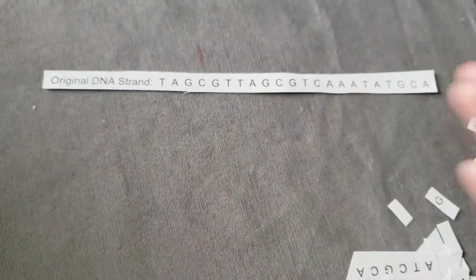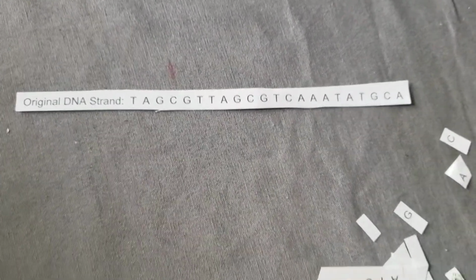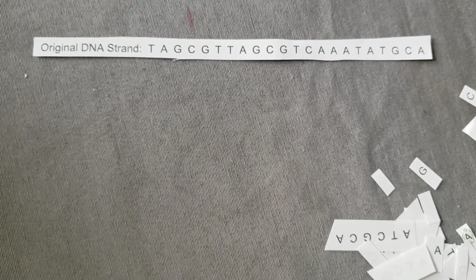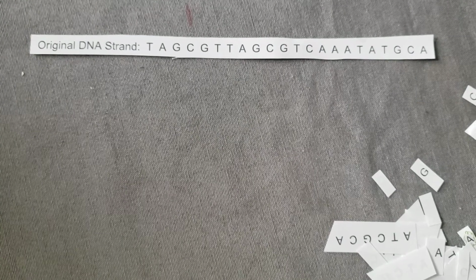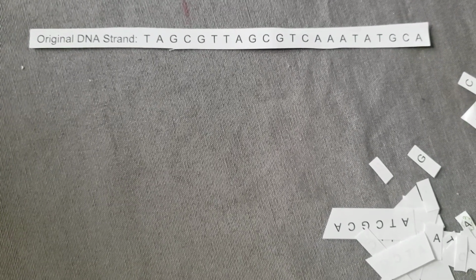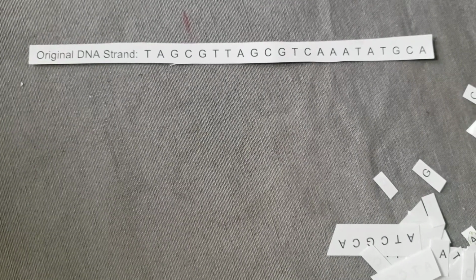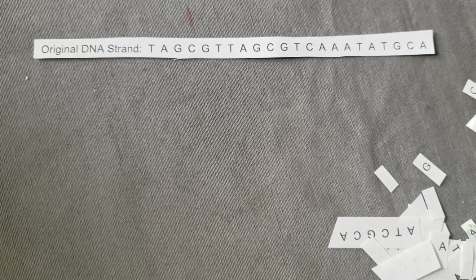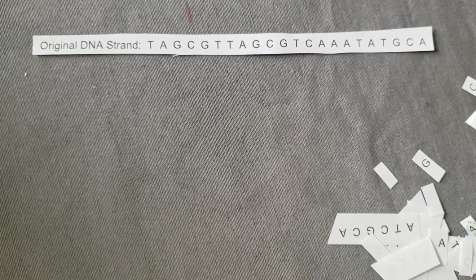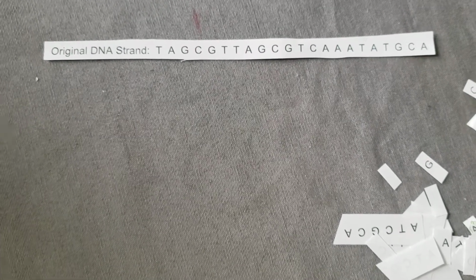We have a pathogen's DNA that we want to sequence. We already know that the individual afflicted with the pathogen is a Homo sapien, a human. So we really don't care about the DNA that belongs to the human. So essentially what's going to happen is we get a DNA sample from this individual, and anything that pops up as human DNA is irrelevant, but anything that's considered foreign DNA would be of interest to us.